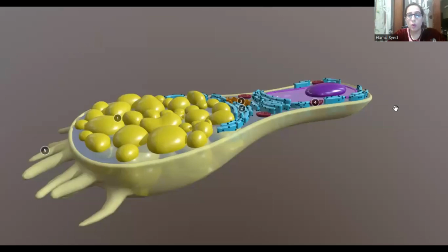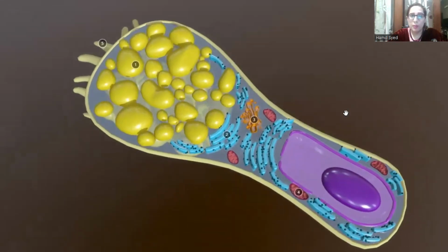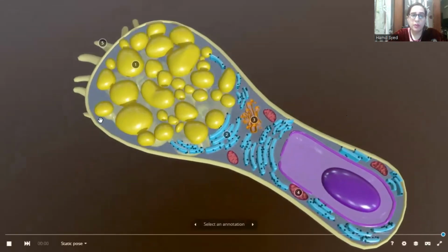Okay, so here is a goblet cell, and if you look at this goblet cell, let's look at the shape, which I told you is like a goblet. This is the apical end, the end towards the lumen, and this is large and round in the form of a cup. And in the basal portion, it narrows down into a stem, the narrow stem of the basal end of the goblet cell.